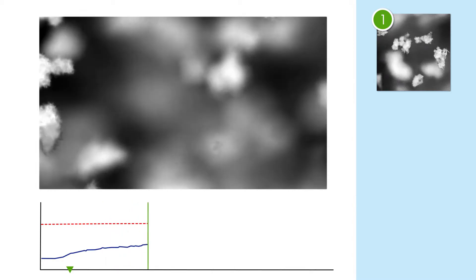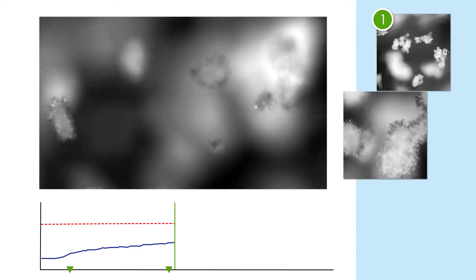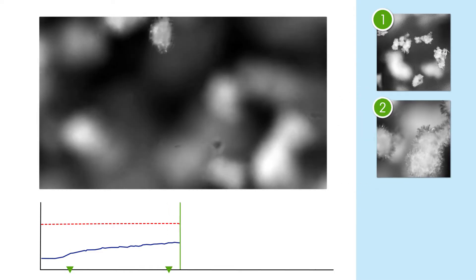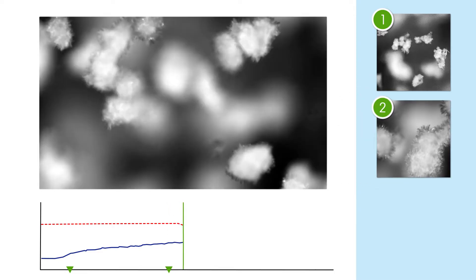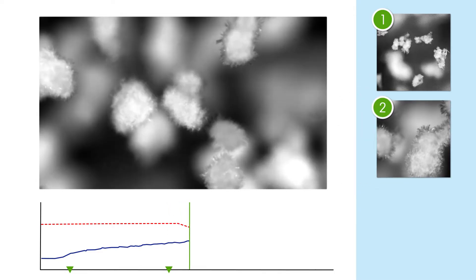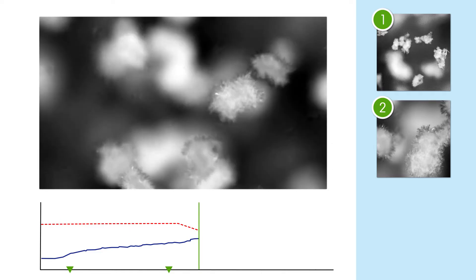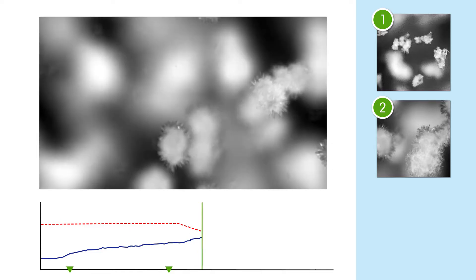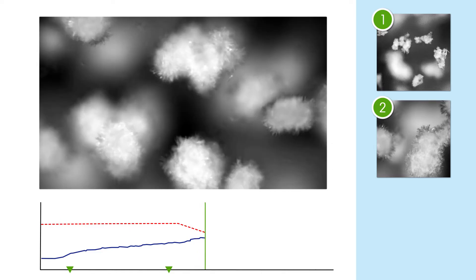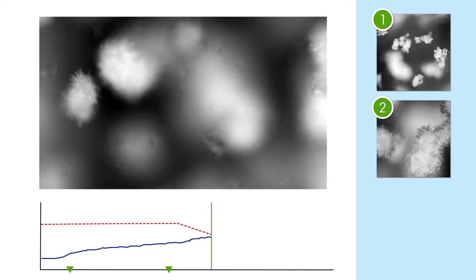Next, something interesting happened. Fine needles began to grow out of the agglomerated seeds, forming delicate dendritic structures. This is something that would be very difficult to see with an offline microscope because the mechanical action of sampling would probably destroy them.